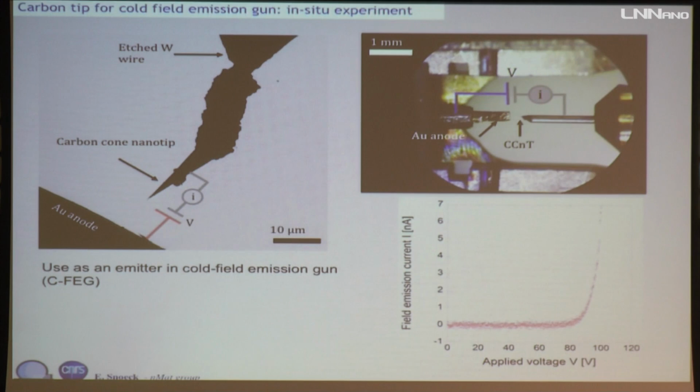In our lab, there is a group who made this carbon nanocone, which is a cone. It's much more robust. It doesn't vibrate. So we try to use it as a new field emitter, a new electron source. And then we do an experiment inside the TEM. So as I said at the very beginning of my talk, there are different kinds of electron sources.